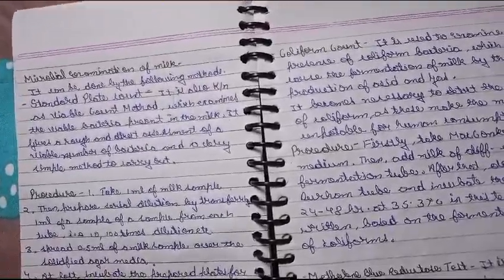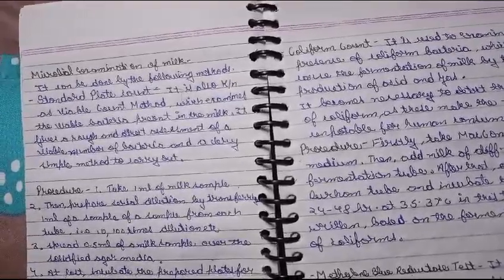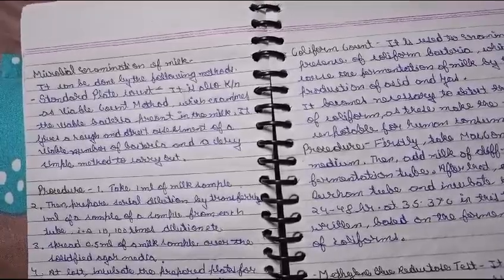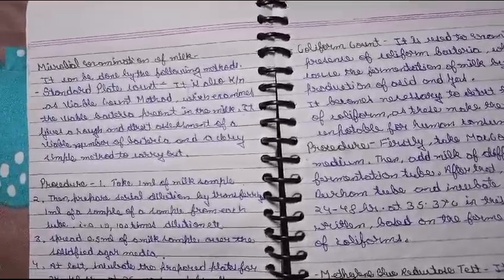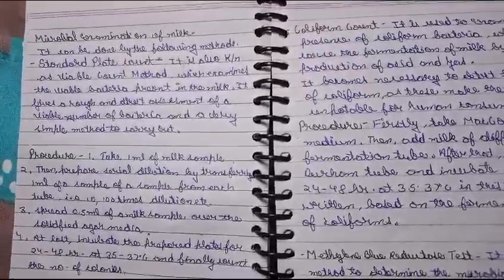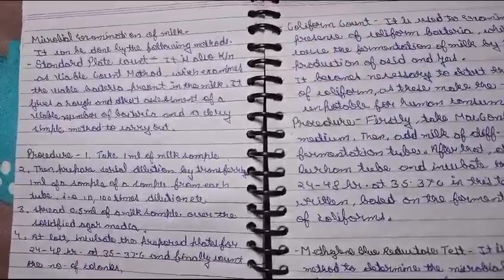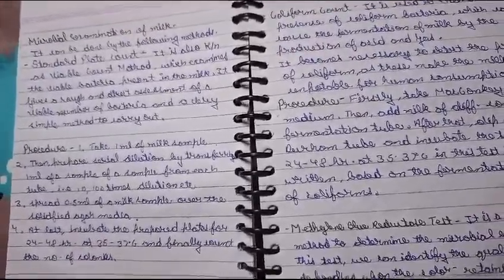Procedure: firstly, take MacConkey fluid medium, then add milk of different concentrations in the fermentation tube. After that, the same process like standard plate count. All dilutions are the same, only the media is different.